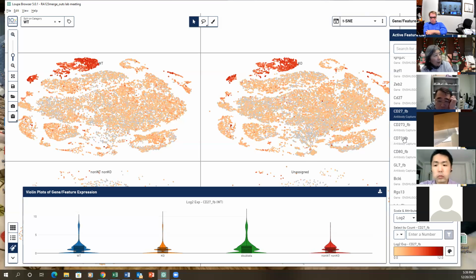So it's the transcriptome we need to compare, but not the CiteSeq antibody. For each group, wild type and knockout, they were stained in the same tube. That means the antibody concentration is the same for both populations. So what would be good is if you work on this a bit, separate knockout and wild type, and separate out the populations like germinal center based on the CiteSeq. Oh, we'll do it. Then look at the gene expression. But Shanrun already did it. Actually, oh, okay, yeah, I did it.